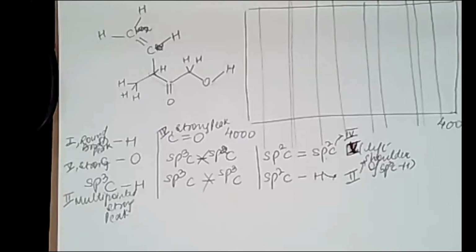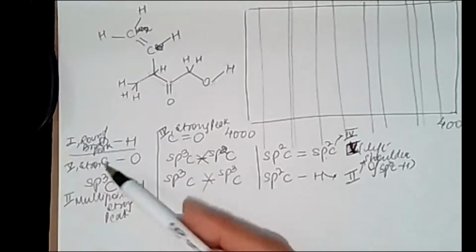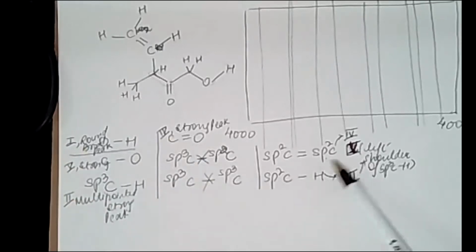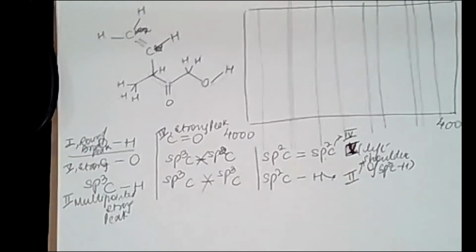So we listed out each of the regions and their shapes. If you are still confused on what this peak type looks like, let's look at OH. OH is in region 1. No other peak that we have listed out falls in this region.